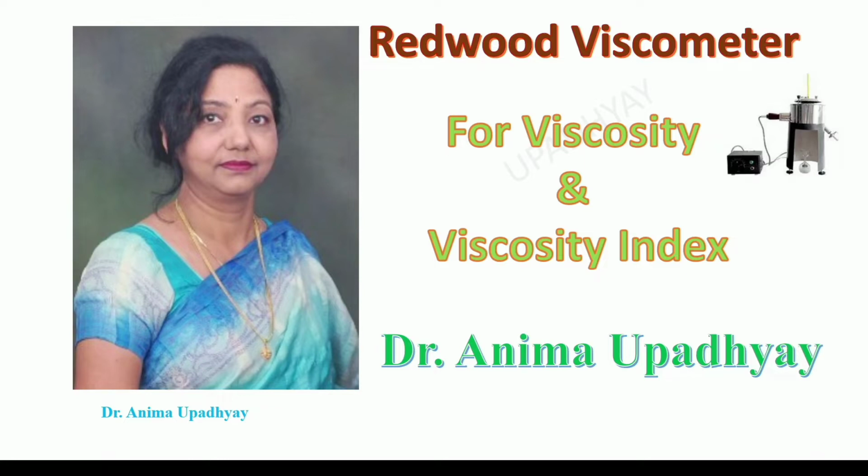In today's video, we will learn about the determination of viscosity and viscosity index using Redwood Viscometer.